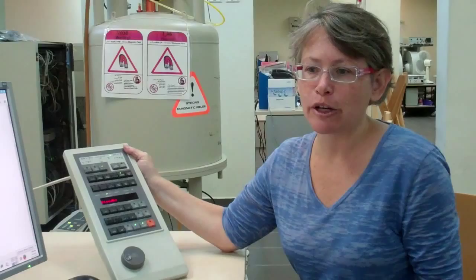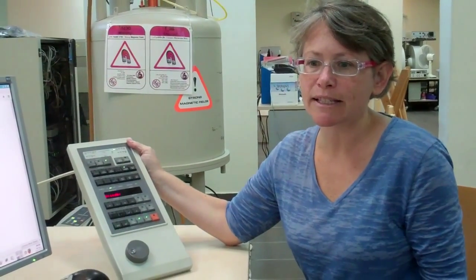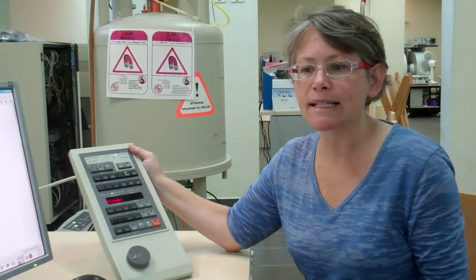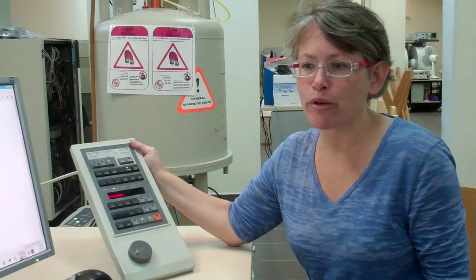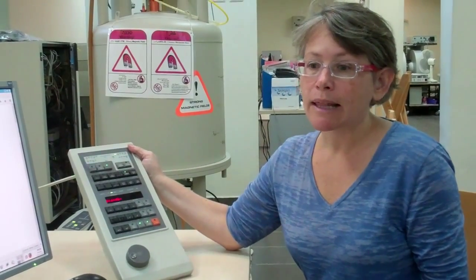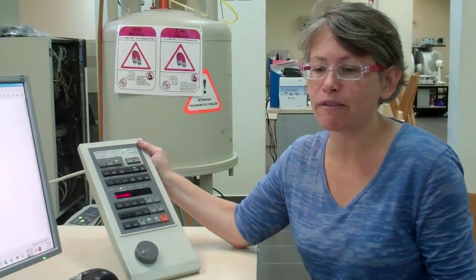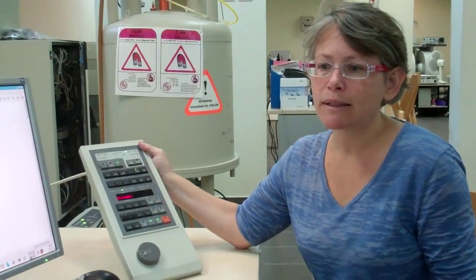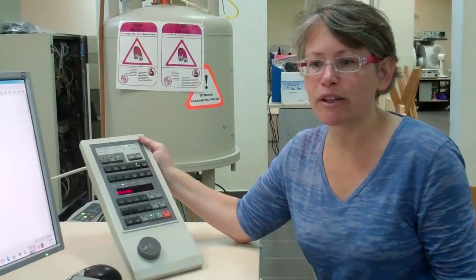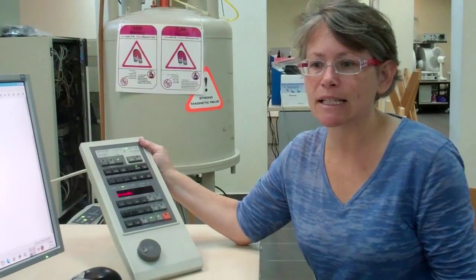When we spin in this way, any magnetic field inhomogeneities along the x-axis or along the y-axis are averaged out over every full rotation. Thus, instead of trying to correct for spatial differences in the external magnetic field, we just smear them out. That simplifies our magnetic field corrections to a single axis along z.